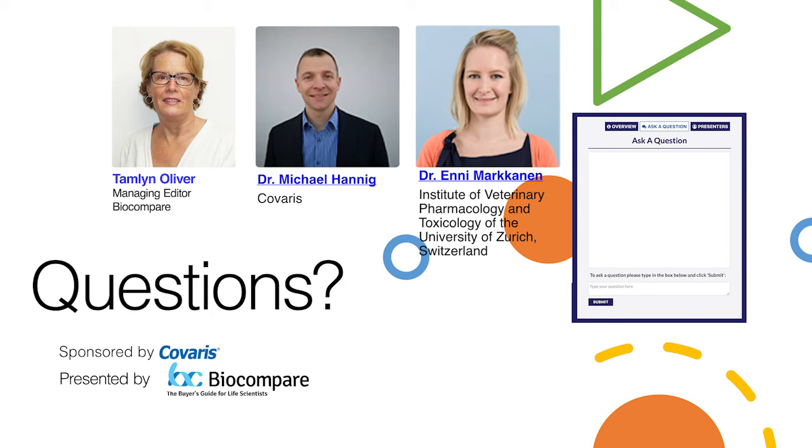Okay, thank you, Michael. Enni, you're up next. How do RNA-seq results from FFPE compare to those obtained from fresh frozen tissue? So thanks for the question. I have to admit we haven't done really any extensive comparisons between fresh frozen and FFPE tissue, because we mainly work with FFPE tissue.